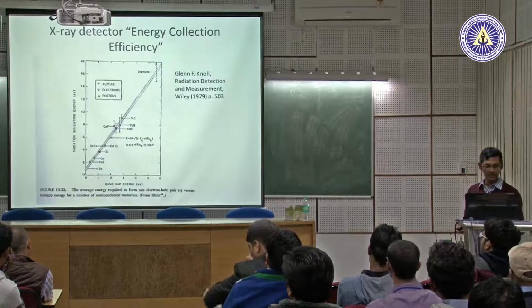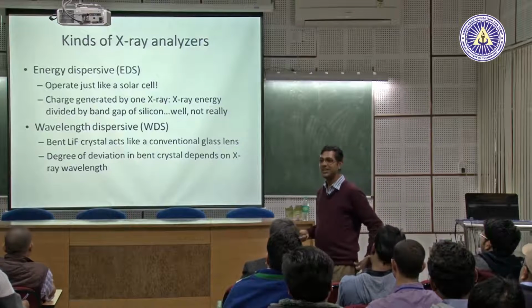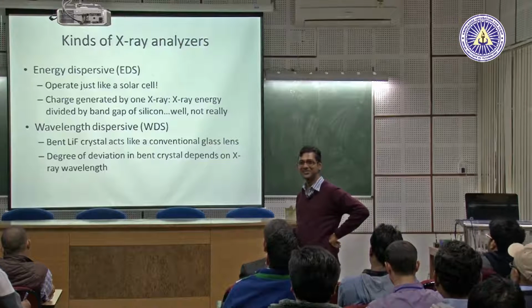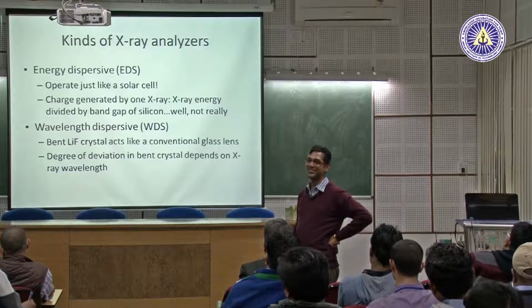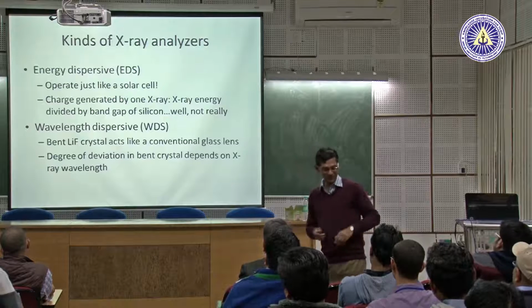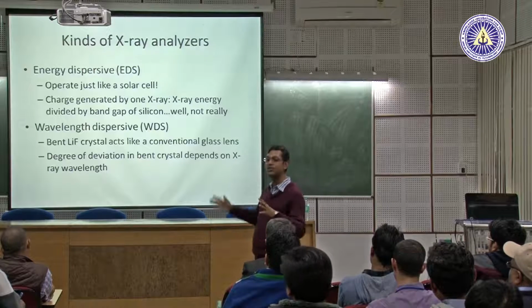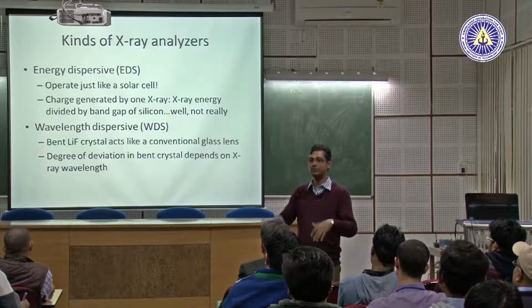And on the other hand, this technique doesn't rely on this. This technique relies on X-ray diffraction. Let me explain. This technique relies on Bragg's law. You generate all kinds of X-rays by bombardment.